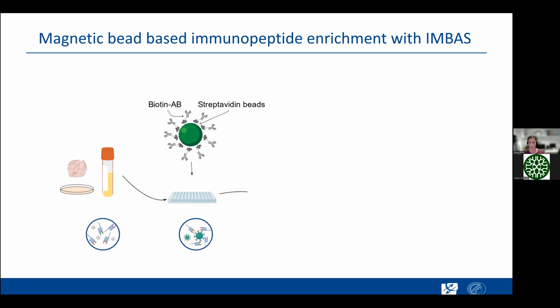So I just need to mix this with my plasma. I don't need to cross-link the antibodies to the beads, and I also don't need to pre-clear the plasma prior, because what is traditionally to be done is either doing a cross-linking step or using protein A or protein G to capture the antibody against the HLA protein complex, which gives obviously the problem in plasma that you have to pull down previously the IgGs to not pollute your sample.